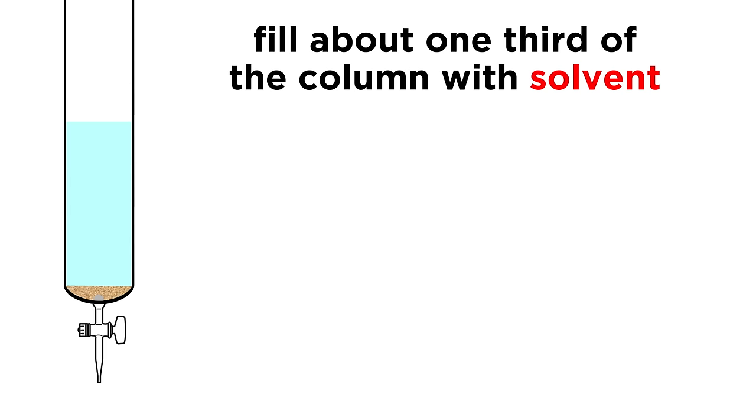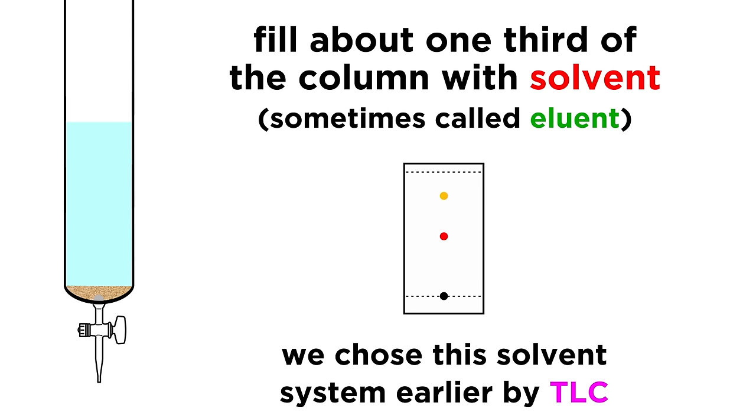Next we fill up the column about a third of the way with our solvent system, which is sometimes called eluent. This is the solvent system we selected by TLC, the one that gives us the optimum separation of the components in the mixture.